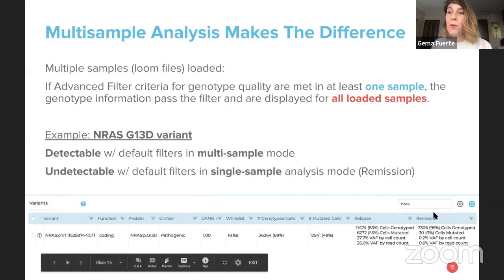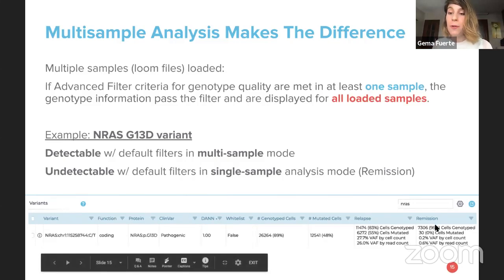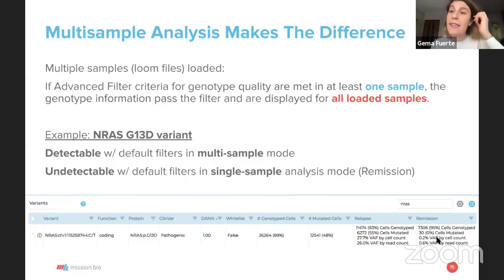How do you assess the quality? You can do it on Tapestri Insights easily. You can look at the variant and see the distribution of the quality. And when you work with multi-sample, same, if you wanted to look at the remission, and in this case, the variant is not present because of a problem with quality, you could also use a bed file or a whitelist to look for that specific position, and you will see everything. So you will see very bad quality, medium quality, high quality, you will get everything. So nothing will get filtered out.